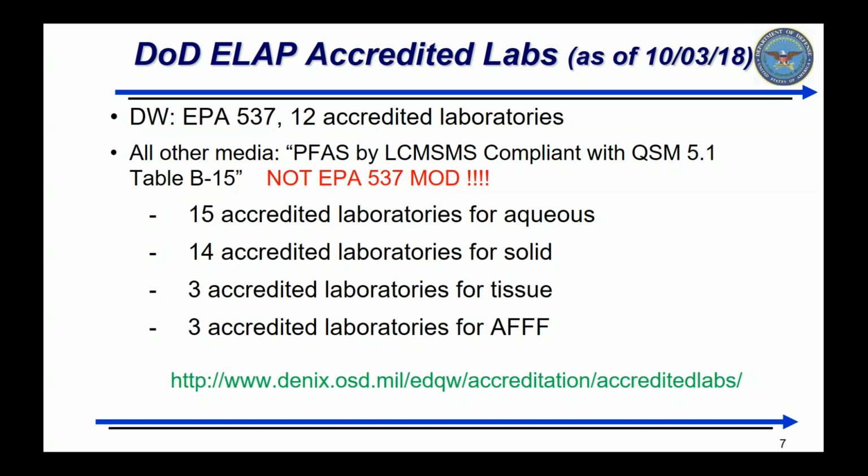I have on the slide that those media are accredited to PFAS by LCMS-MS compliant with QSM 5.1 Table B15, not EPA method EPA 537 mod. I make this distinction because there are still laboratories within our program that get accredited to EPA 537 mod method under their scope for use for other clients. A method specified as EPA 537 mod has not been determined by the DoD ELAP accreditation process as being compliant with Table B15 requirements, therefore cannot be viewed as equivalent to methods identified as such.